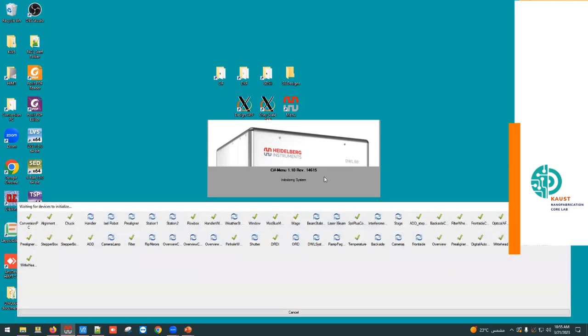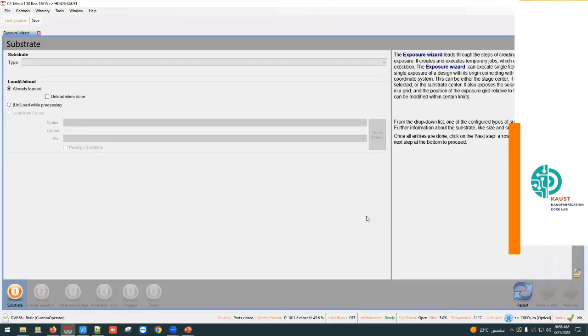And now you see this screen, how all these options are becoming like a green tick. We have to see that all these ticks are in green. Perfect, it's working. It's kind of checking all the system. Now, so this is the interface that you will find, okay?